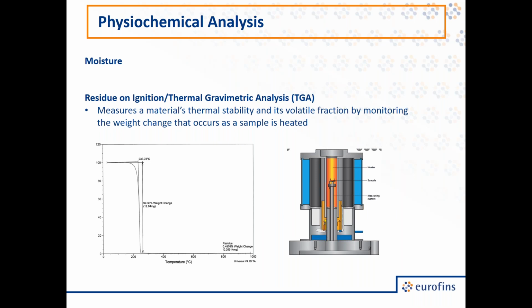For example, if you've got a piece of a gasket that somehow got into your product, knowing that it's a gasket or a piece of rubber is one useful bit of information, but you probably want to know which gasket is breaking down. And in your production line, there are likely to be many different types of gaskets. By comparing them, they're each going to have slightly different compositions.